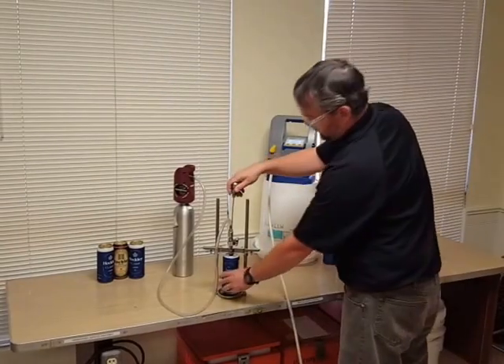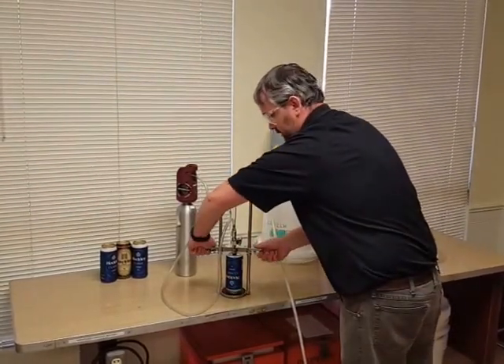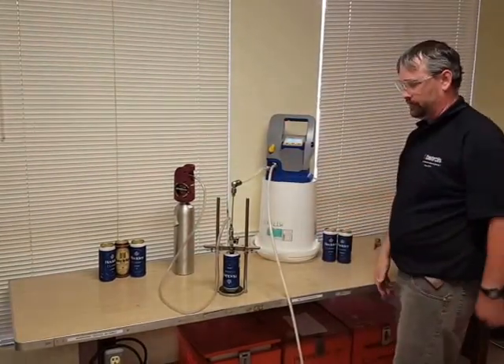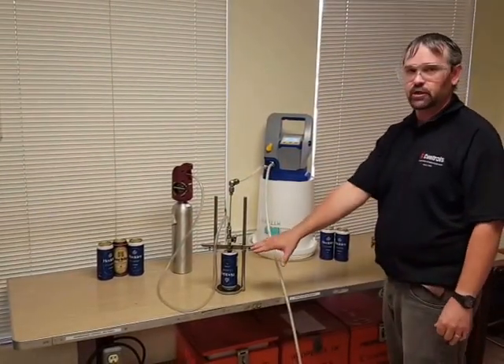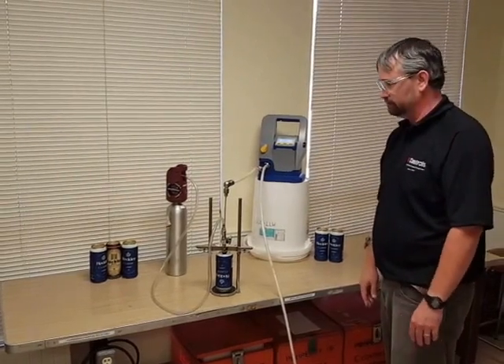To release your can, lift up the sipping tube, release your lock plates, and pull it off. There might still be a little bit of pressurized air inside the can, but it shouldn't cause too much of an issue. And that's it.